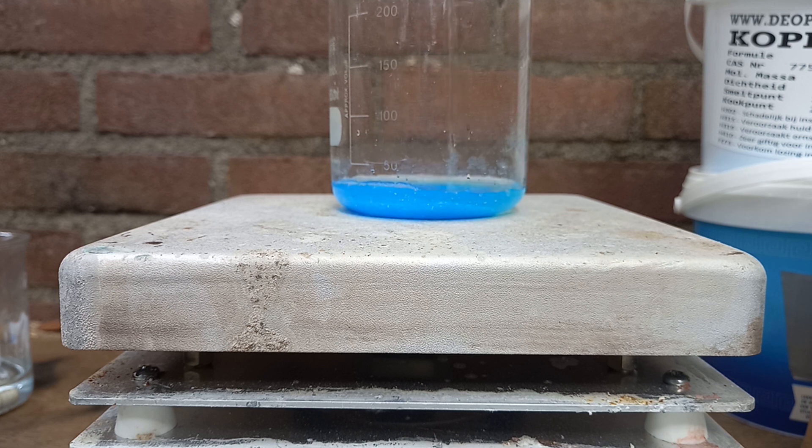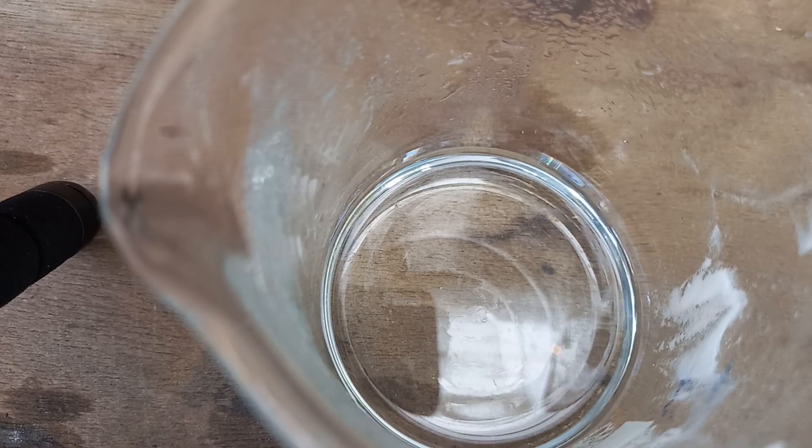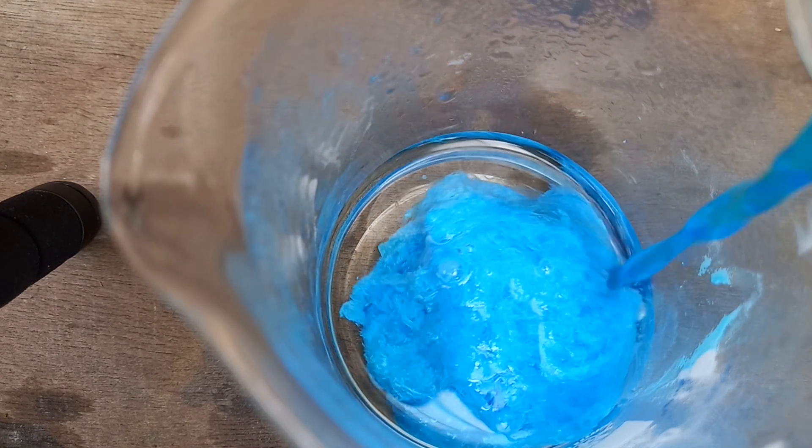So I wanted to introduce y'all to a little project I am working on, and I need a little bit of help, or I want some help. So what I'm doing is I'm synthesizing and isolating a lot of different copper salts for a copper salt collection. And yeah, that's been really fun.